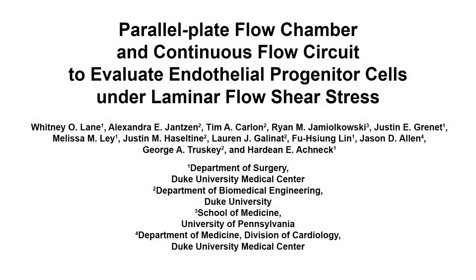The overall goal of this video article is to describe a technique to subject adherent cells to laminar flow conditions and evaluate their response to well-quantifiable fluid shear stresses.